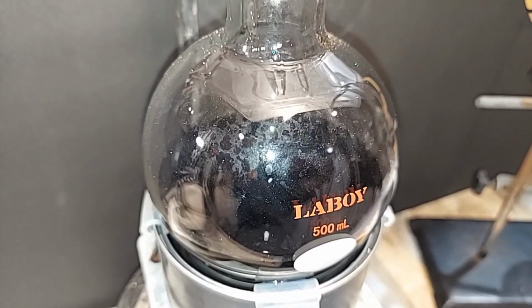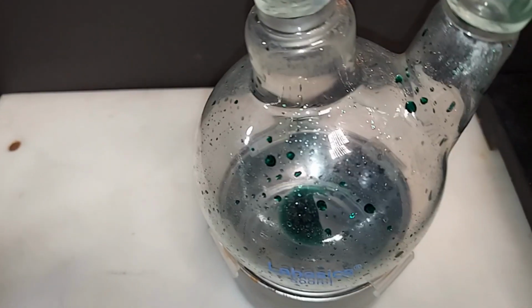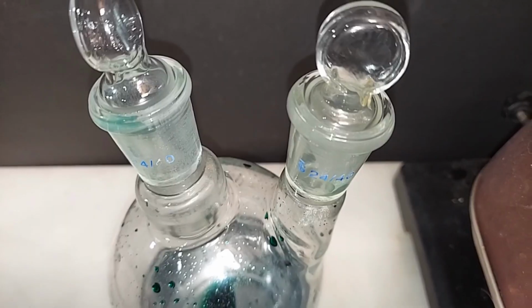And at that point I realized, wow, that's really silly. So I just poured it inside of here. Oh, there's a few drops left in there. It doesn't matter. But I'm not dealing now with having to seal an extra opening, which is always taking a little bit more chance there. So we're ready to go here.